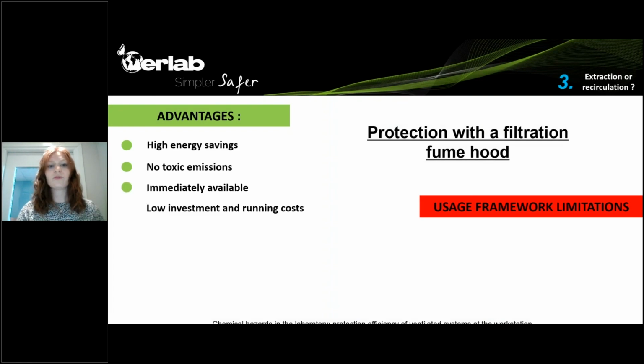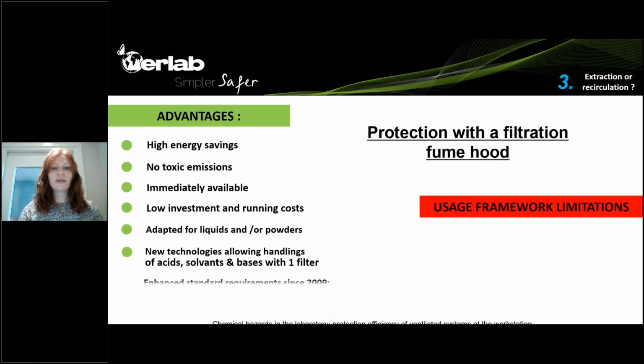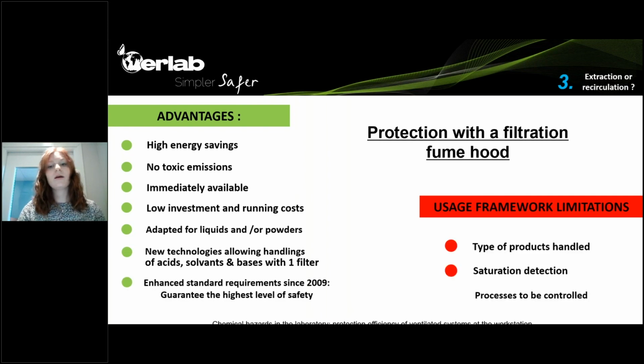And as we've done for the ducted fume hood, we're also going to recap all the different advantages and limitations of filtration fume hoods. The main advantages are the high energy savings, because it is only plugged into the socket. There's no toxic emission into the atmosphere. There's immediate availability of these devices. There are low investment and running costs.